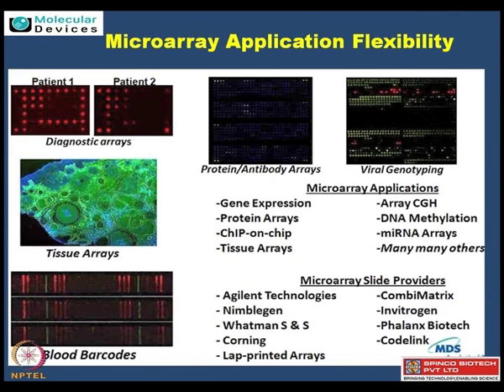And the protein arrays are now really catching up in many senses, because the protein is actually the biological function, which many scientists believe, and I am also a strong believer. So now people are moving from the DNA to the real functional part, how they are directly affected. The major bottleneck was looking at the antigen antibody reactions. Like the proteins are all being seen, there is no general formula, but now the field is catching up. So even at the level of protein arrays, this is compatible. The incoming tissue arrays, which are really in infancy, are also now compatible with GenePix Pro.